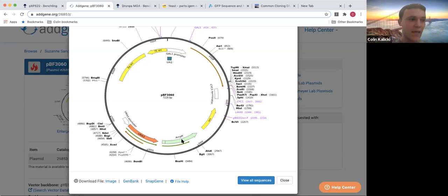Good, exactly. So eukaryotes are going to have post-transcription and even post-translation modifications done to your proteins or to your mRNA, which is going to cause a lot of different things, right? Your exons, your introns, and so on. And so you also want to make sure you design something later that's going to be important for that.